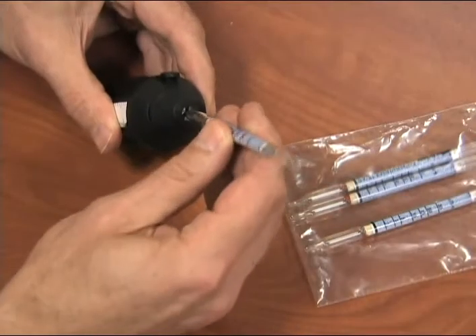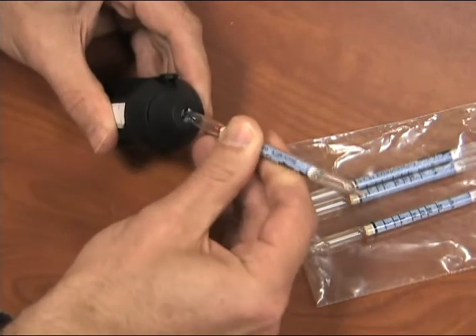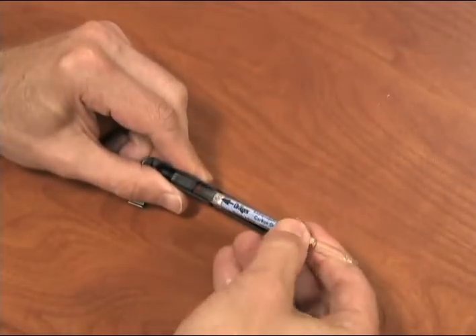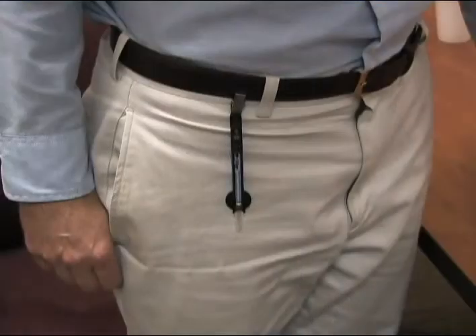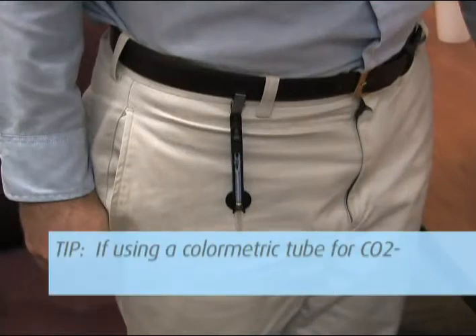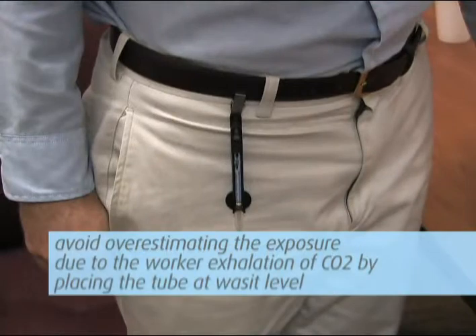To get started, score and break off both ends of the tube and place the tube firmly inside the holder. Attach the holder with the tube inside to the shirt collar of the worker being screened. If using a colorimetric tube for CO2, avoid overestimating the exposure due to worker exhalation of CO2 by placing the tube at waist level.